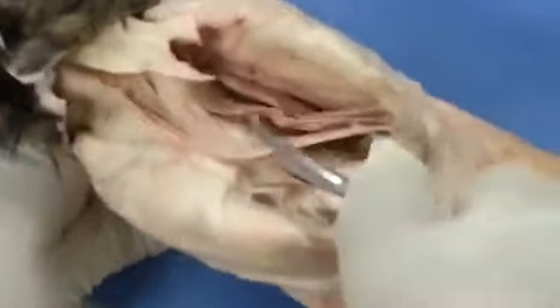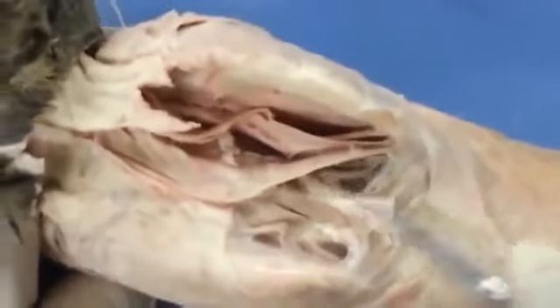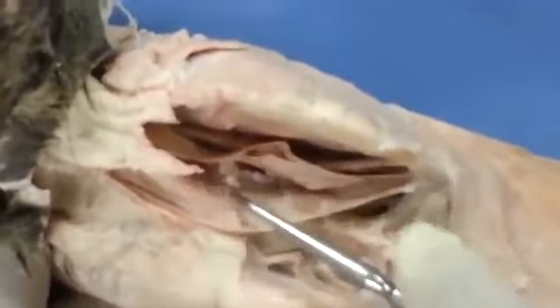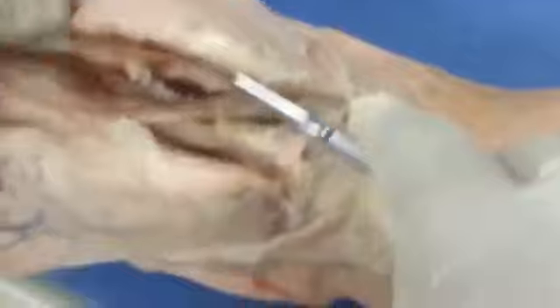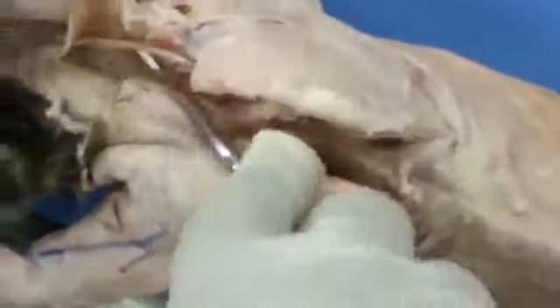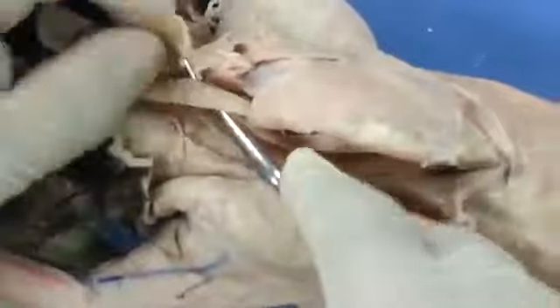For the muscles of the deep back, you're going to see the rhomboideus major muscles here. And as we make our way cranially, you'll see the rhomboideus minors. If you just generally say rhomboideus muscles, you'll be fine. Oh, so we don't have to say major, minor, and capitis? Well, the capitis you do, but not for the major and the minor. It's hard to kind of distinguish. The rhomboideus capitis is this large visible band here making its way to the cranial region.